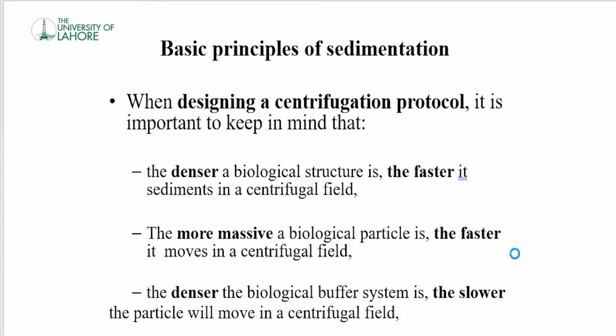From these three points, we can conclude that if the particles are denser and more massive, they can be separated quickly because denser particles settle down quickly at the bottom. While if the medium is denser or viscous, then it takes time to separate the particles.